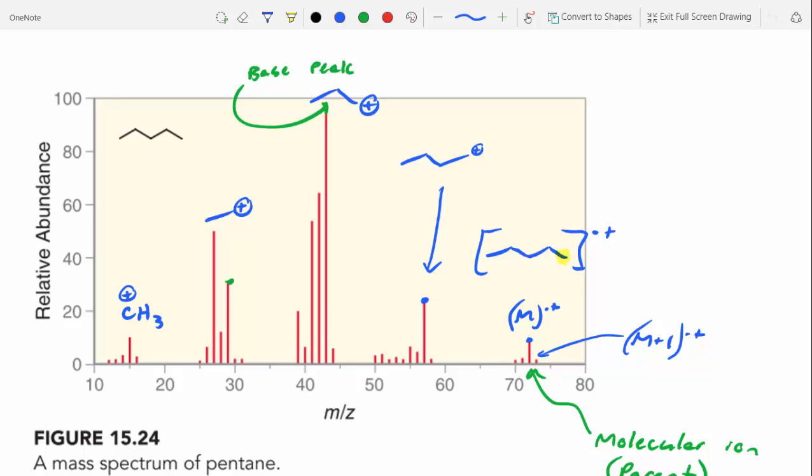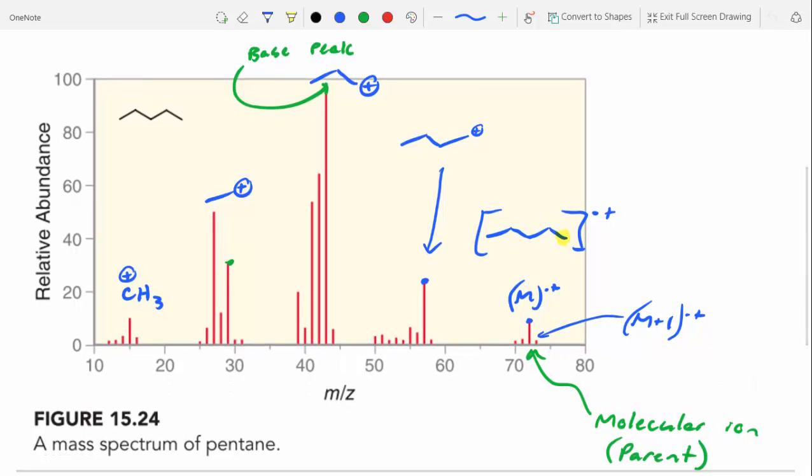So let's continue on with mass spec. If you remember yesterday, we finished by looking at a mass spec of pentane, and we said that there's a lot of information to be gained from a mass spec. The first and arguably most important piece of information is the molecular weight of your parent ion or your molecular ion, and that's the peak cluster furthest to the right, and the molecular ion is the tallest peak within that rightmost cluster. That tells you the mass of your molecule, assuming that there's a charge of 1, which 90% of the time it will be a charge of 1.